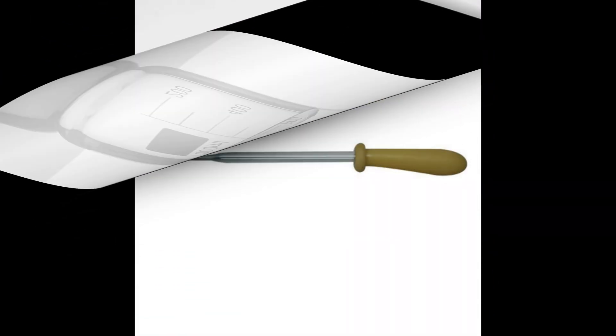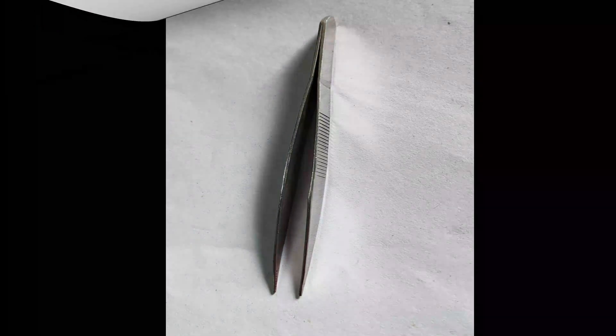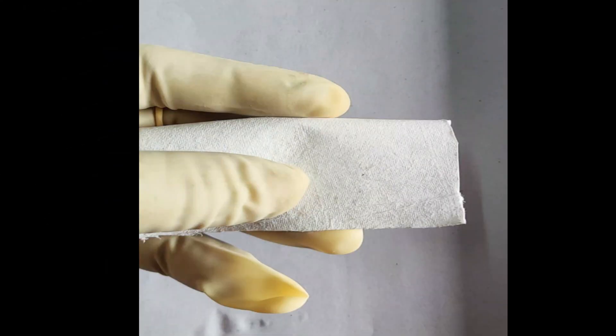First we will scrape the inner lining of the cheek very gently, and after collecting the material we'll take a glass slide and pour a drop of water.